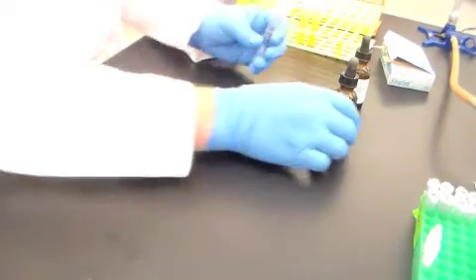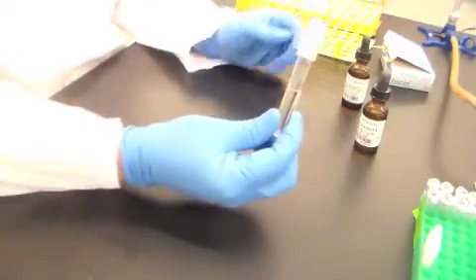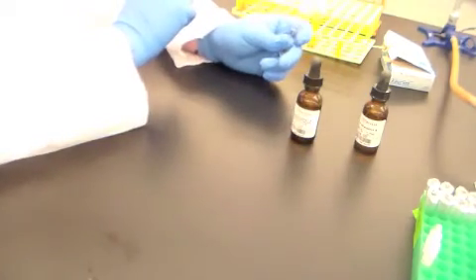In reality, what you can already see is a red color beginning to develop. So what that red color is indicating is the presence of nitrite ions. The media, as it began, was very rich in nitrates but very poor in nitrites. So this is uninoculated media. So we're going to use this as a control, just so you know that this red color doesn't just develop automatically in this media.